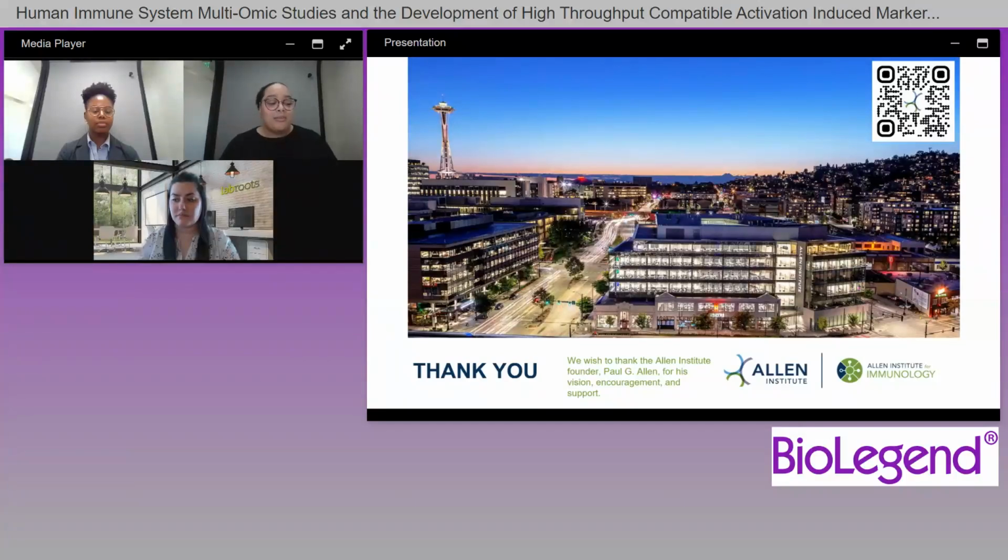I wrote down a couple of things while listening to this presentation. I went to a university that had one instrument, a Biorad S3E, that was to support all of the research happening at the university, and that meant it was really hard to get onto those instruments. So this would have been a really nice thing to have in a low-funded university.